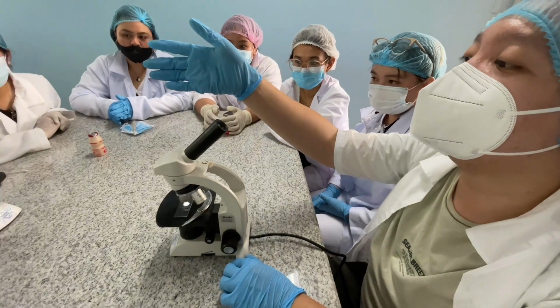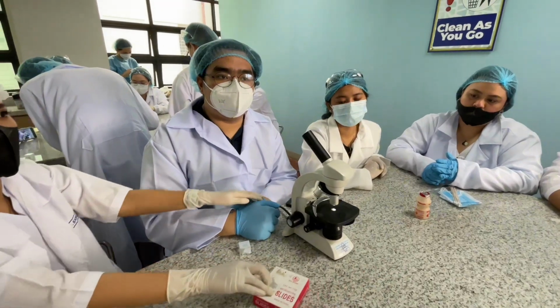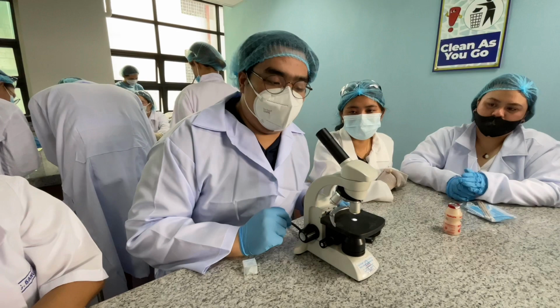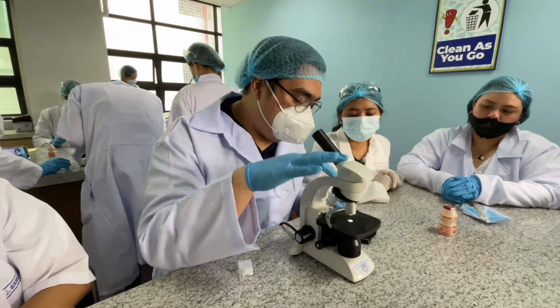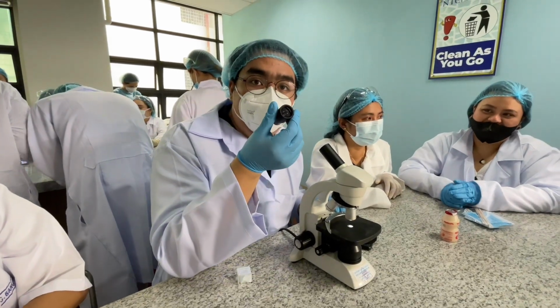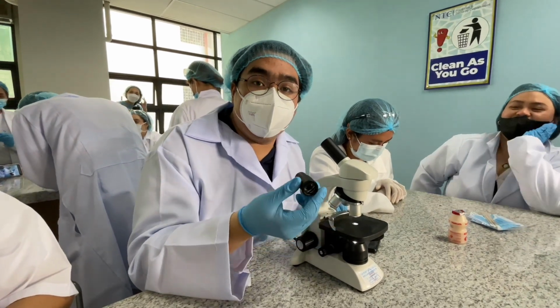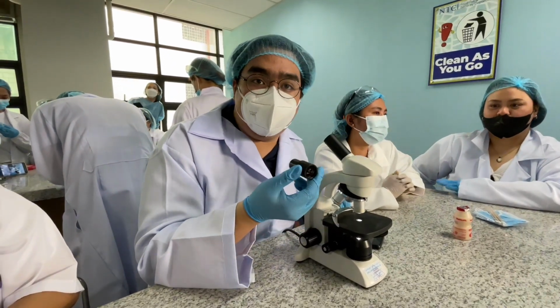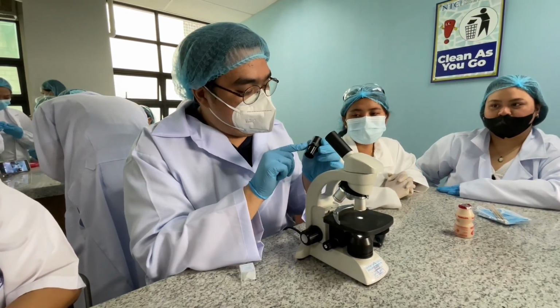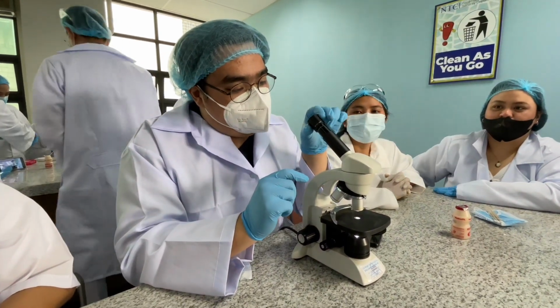Now, Isaac, try to explain to me what the first part is that we need when it comes to checking the experiment. Thank you, Roman. Now, the first part that we need to learn about our electronic microscope is the eyepiece lens. The lens here is adjustable based on magnification. So if you want to use a specific magnification, this is where you would change lenses. Most of the time lenses show their magnification right here. Yes. So then it just slides down like that.